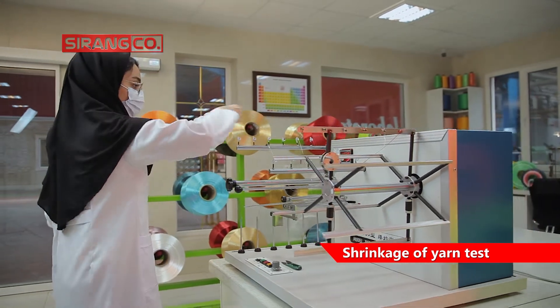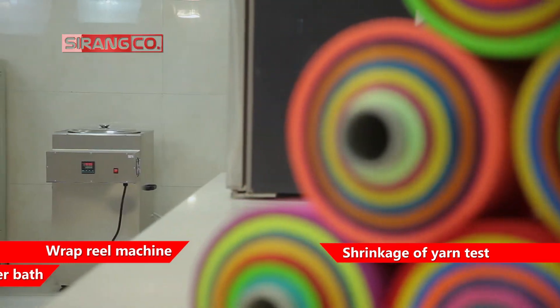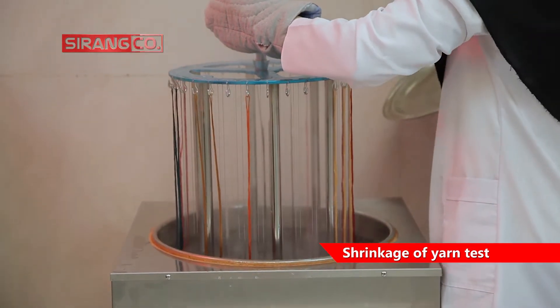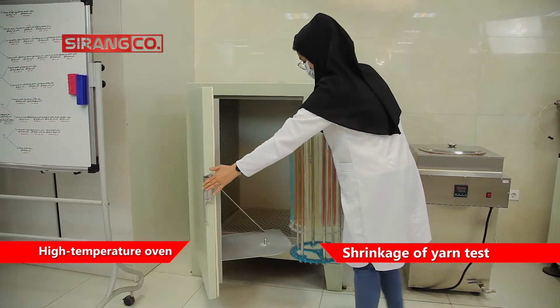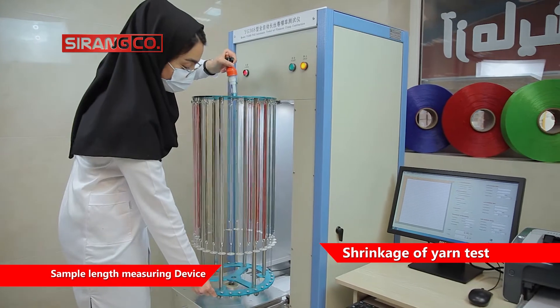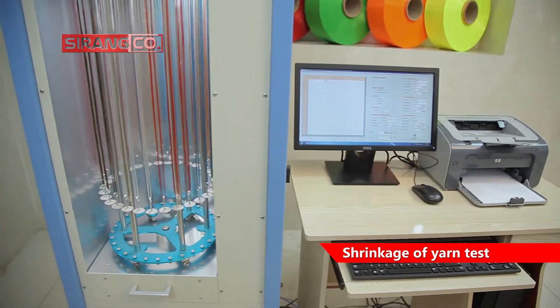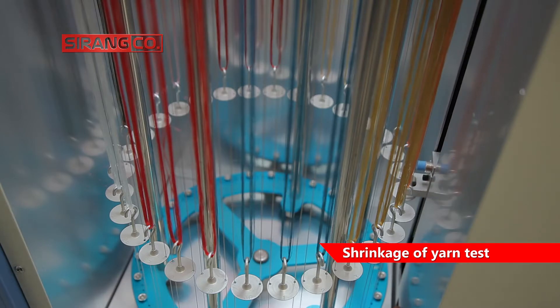To prepare yarn samples as skein, an automatic wrap reel machine is used. The boiling water bath has a suitable width and depth and, using a holder, the sample is fixed in it. The high-temperature oven can provide hot air up to 200 degrees centigrade. The sample length measuring device automatically applies certain stress to the yarn samples and determines their length with a resolution of 0.05 millimeters, and shrinkage is calculated based on the lengths measured by the machine software.